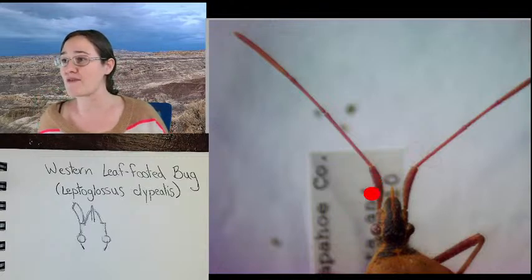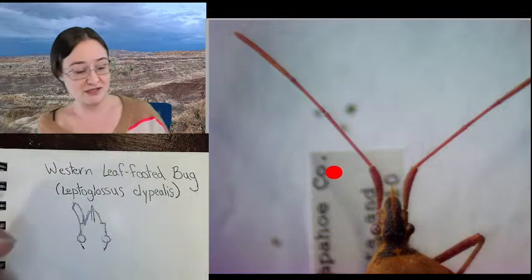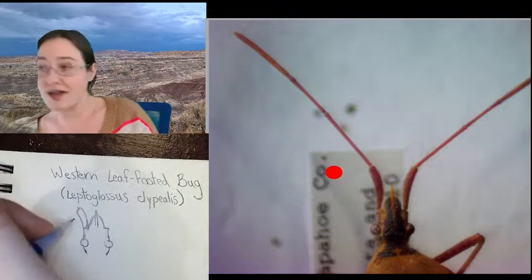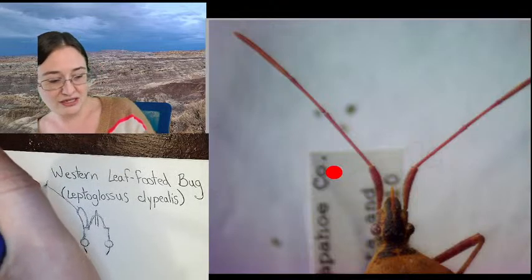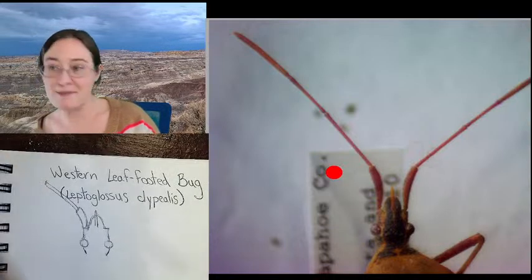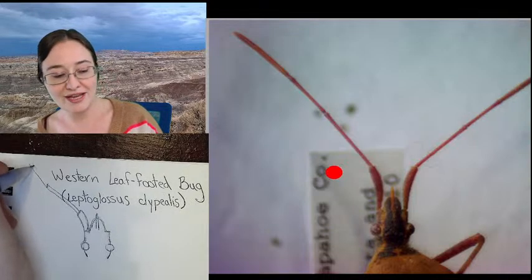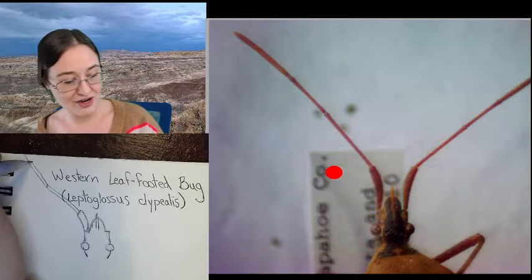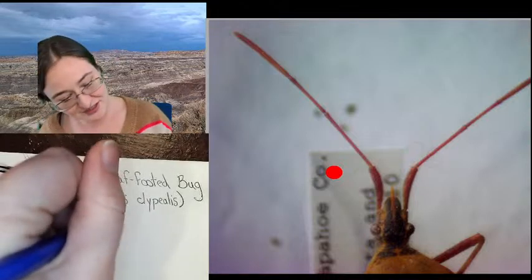We can say, all right, we've got one. And then we have two, this very long one, three, and then four. This guy only has four antennal segments. So making sure that we give credit to that, right? So one, two, and his segments are just going to go off my page, and that's fine. It's going to happen. Three, four. He says, I'm reaching for the stars.